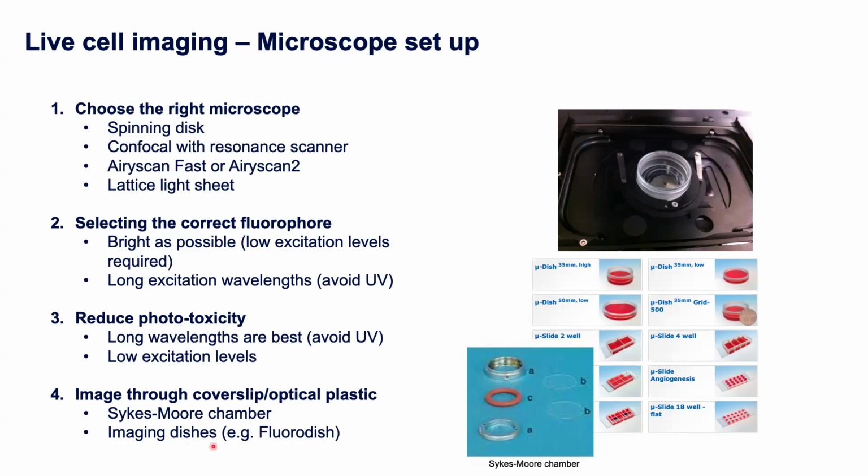Or you can use imaging dishes or slides like these. These are from ibidi, FluoroDish. There's plenty of vendors that make these. But again, these are imaging through high quality cover slip thickness bases to get you the high quality image data at the end. So that's live cell imaging.